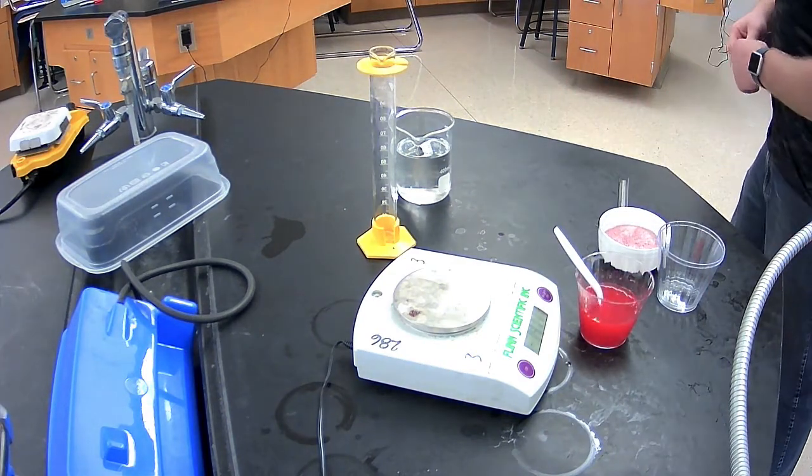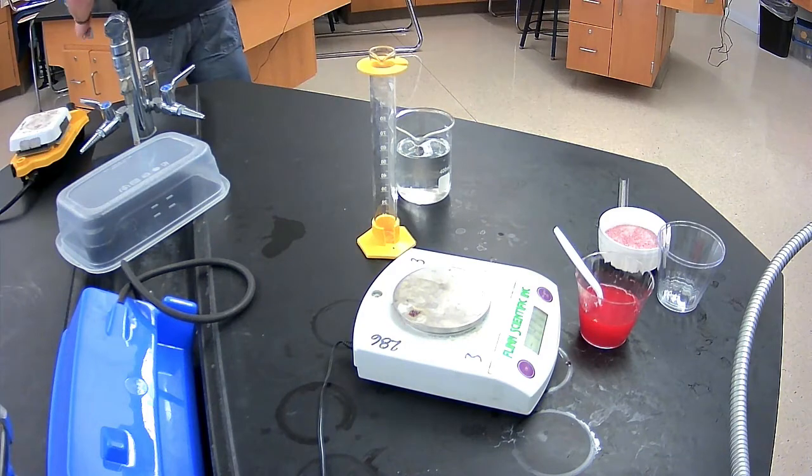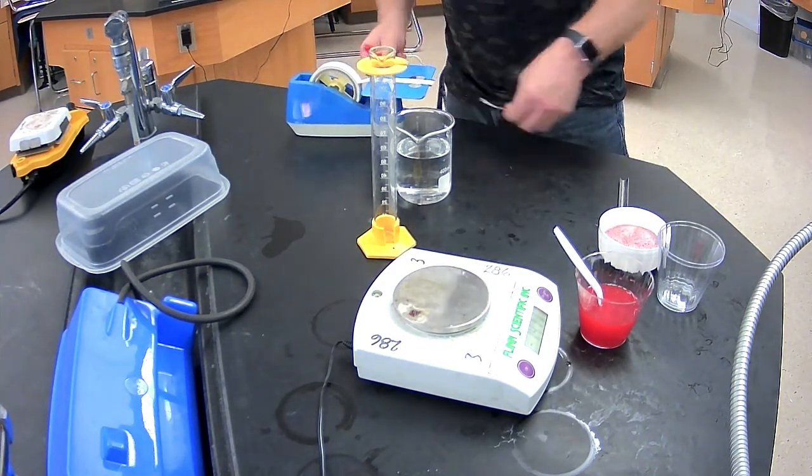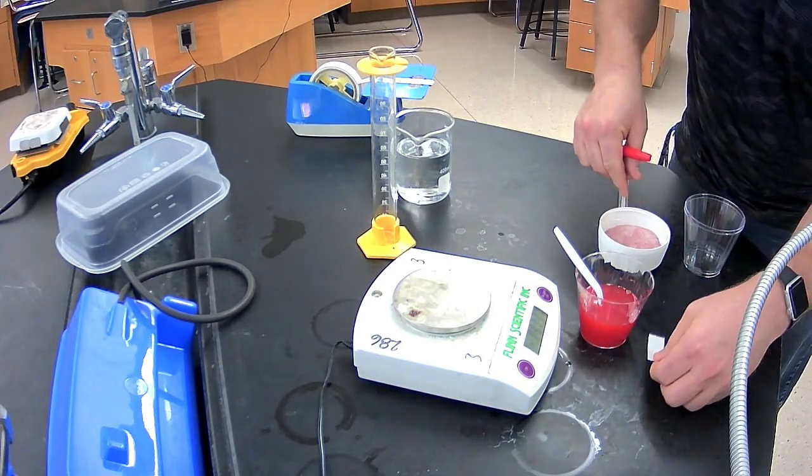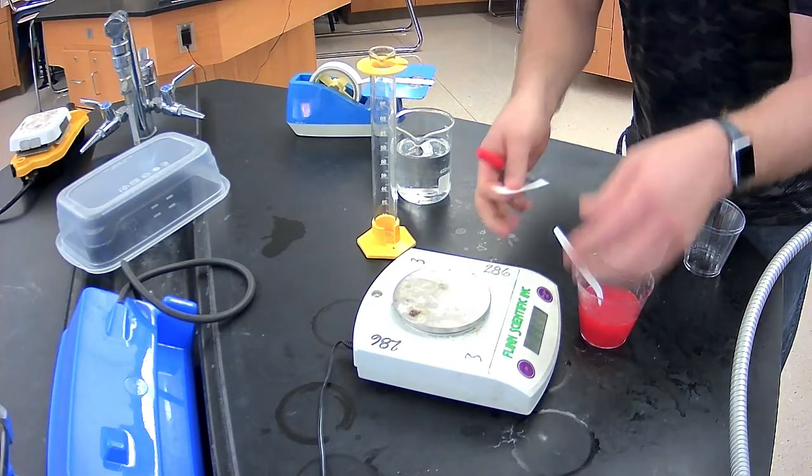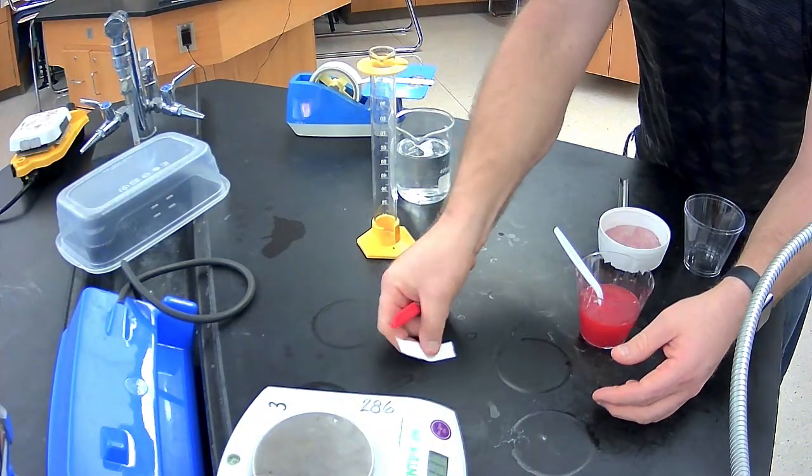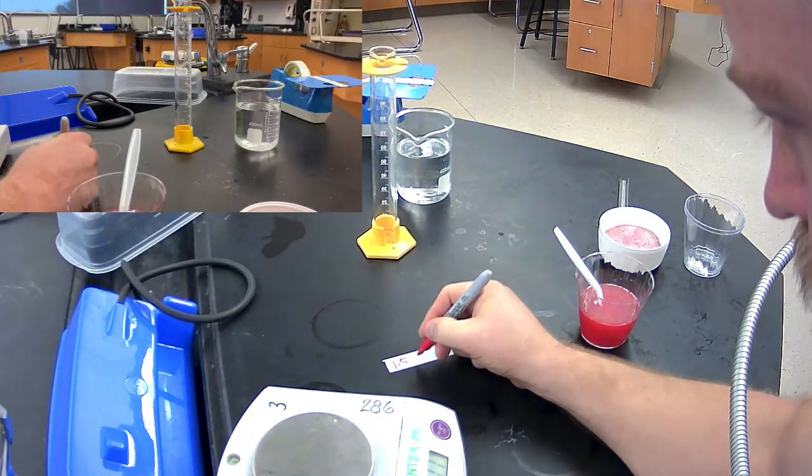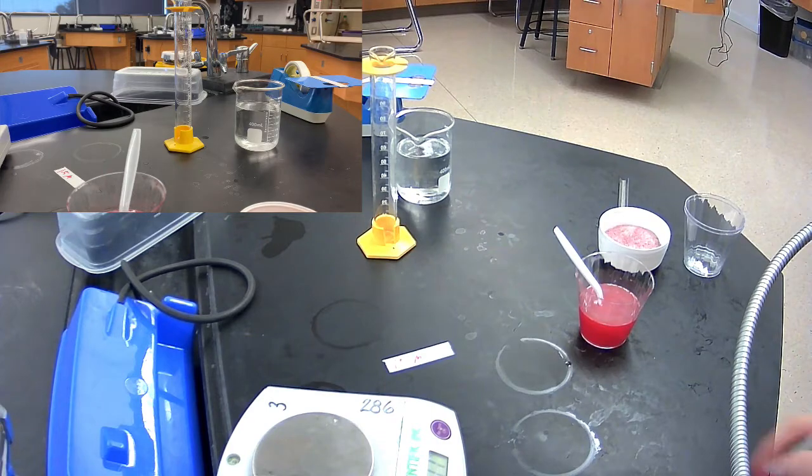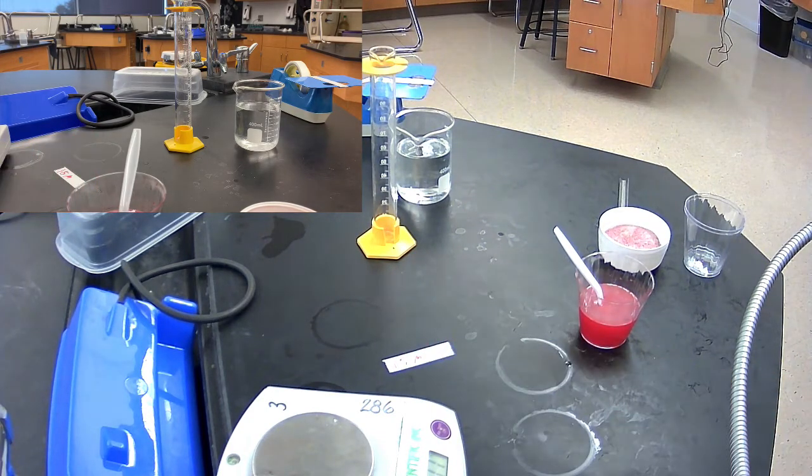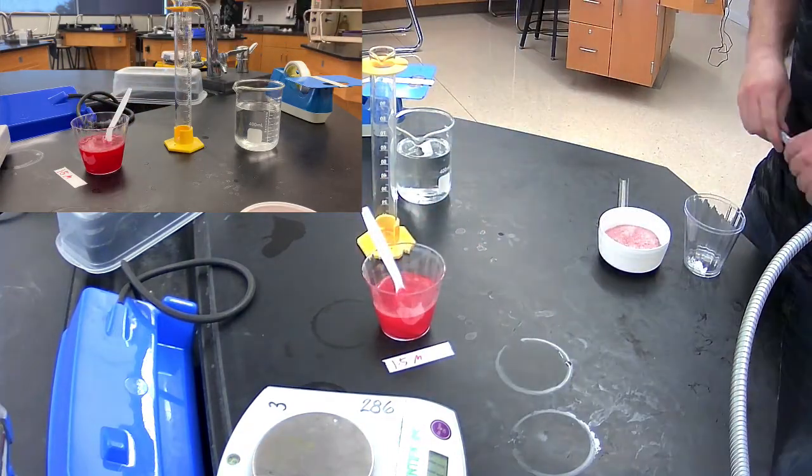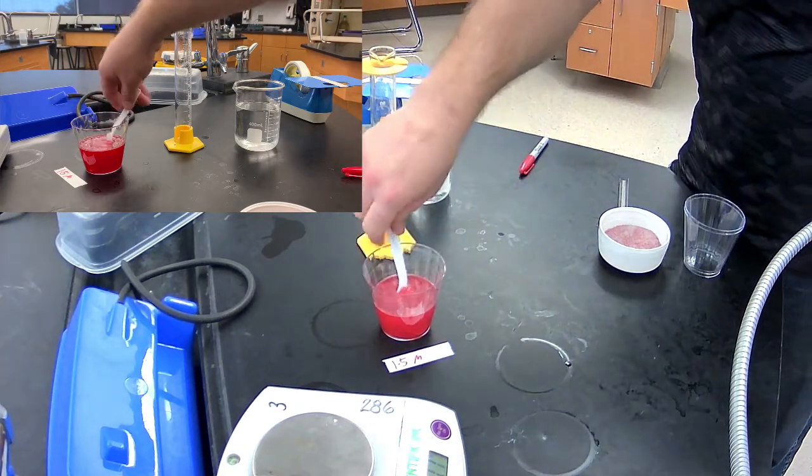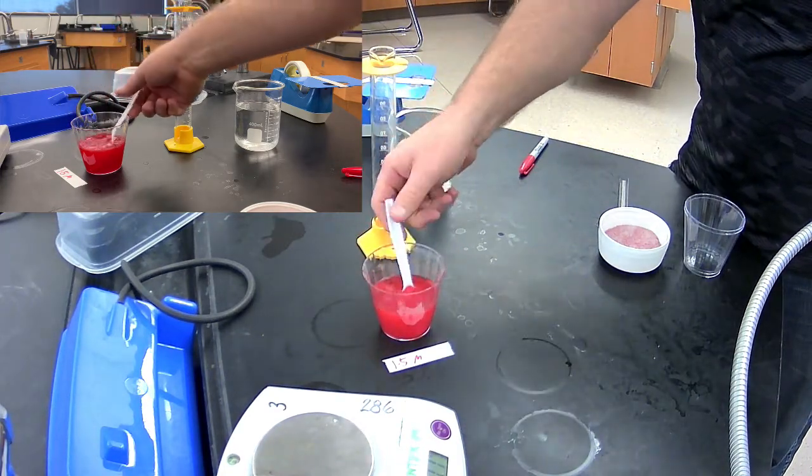So that is 1.5 molar Kool-Aid solution. So I'm going to label that. So we keep track of which solution is which in our settings here. Now, that's the first step in this process is to create our first stock solution. And then from this, we now can start going through the dilutions.